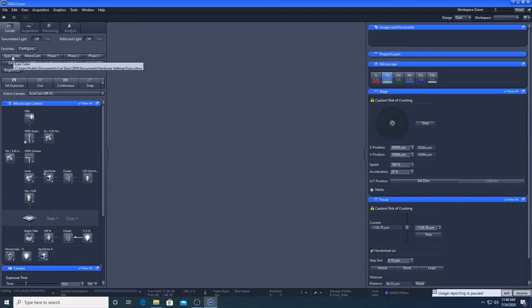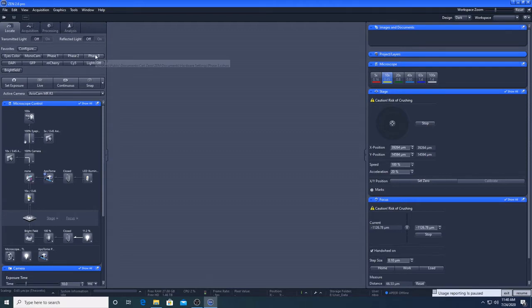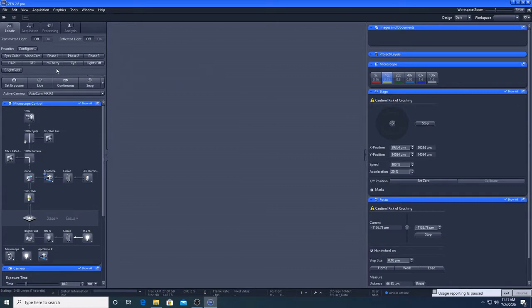There are three buttons for phase imaging and four different filter cube and LED combination options represented by a common fluorophore name: DAPI, GFP, mCherry and Cy5.